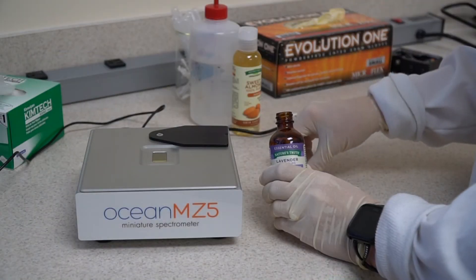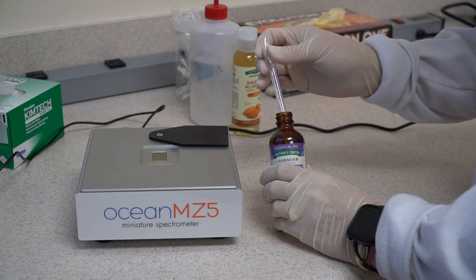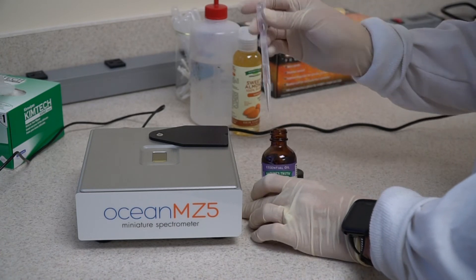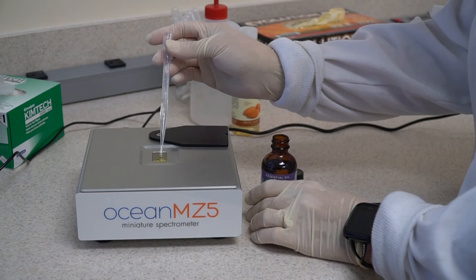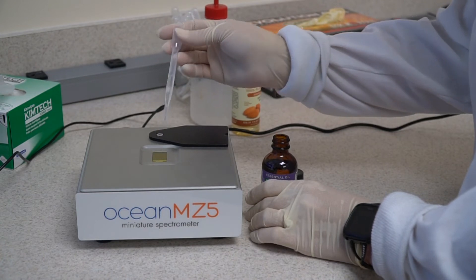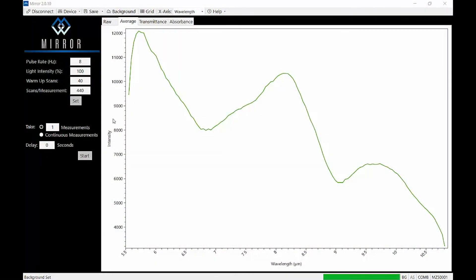You are now ready to collect spectra for your actual sample. Pipet enough sample to completely cover the crystal, making sure you don't spill the sample or overflow the sample well. Now you can choose how many spectra you want to acquire for your sample using the options with the Take setting.